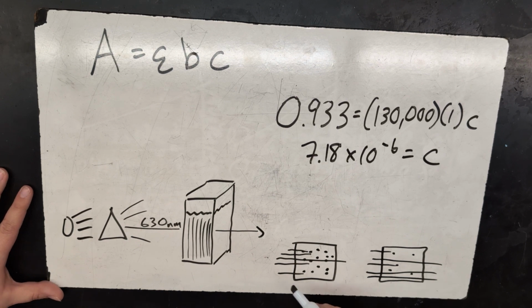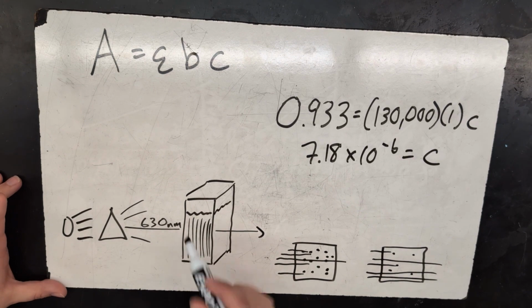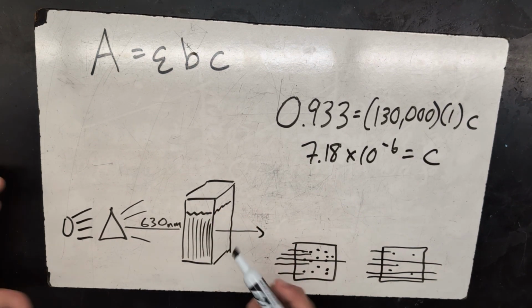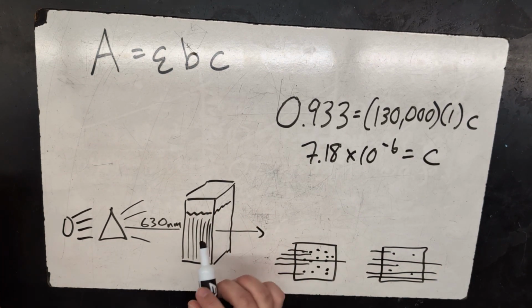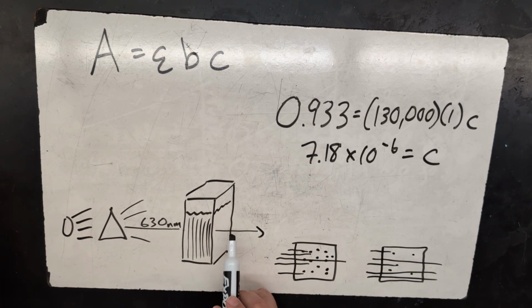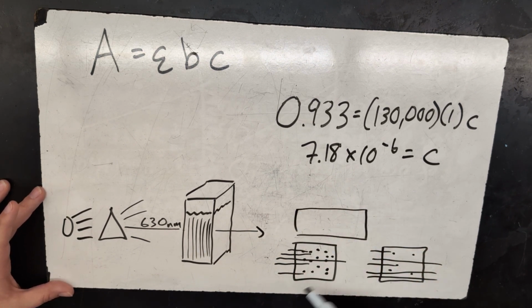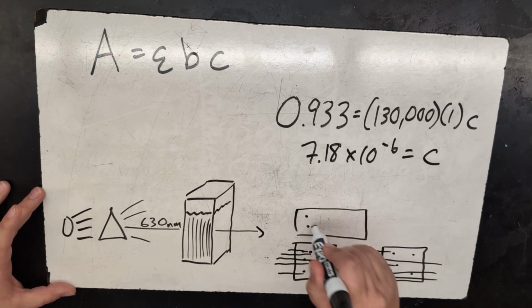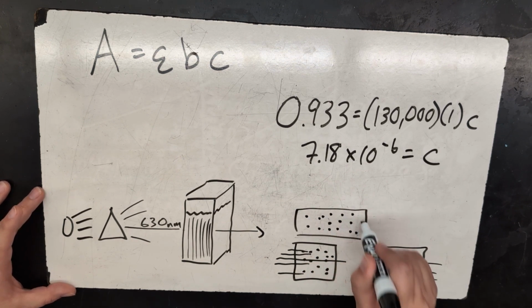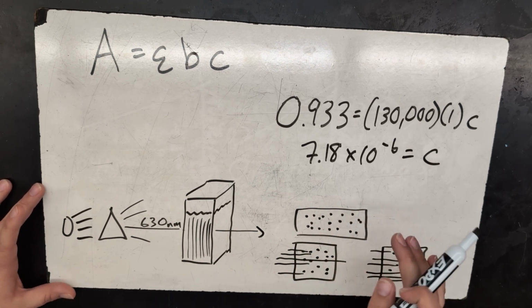This is also a good time to talk about the cuvettes themselves. Our cuvettes will typically be square, or at least rectangular, because then we can measure the specific length that the light has to travel through the cuvette. And that matters, because if I have the same concentration as this one, but the light has to travel through more distance, more of that light is going to be absorbed. So how far it has to go really matters.